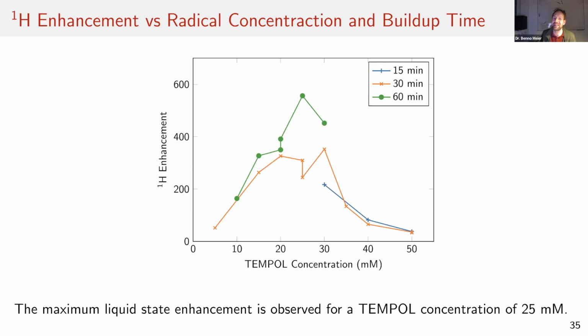Yeah, good question, Asif. It's just something we observe. When we do carbon hyperpolarization, we fairly easily get 40% polarization in the liquid state. But with protons, it's much less. And I think now we understand, for example, that we have not been using anything close to the optimal radical concentration, because we did use values around here for much of the time. And maybe it's quite simple.